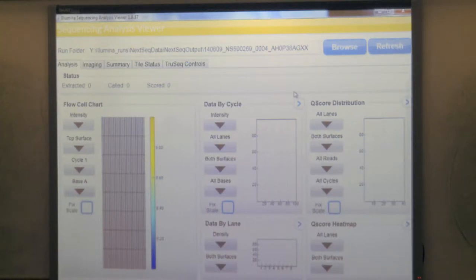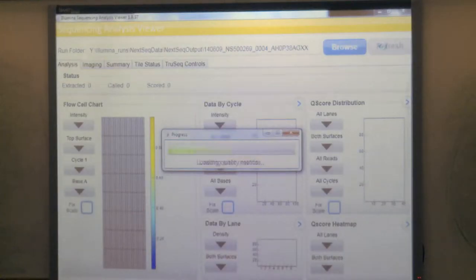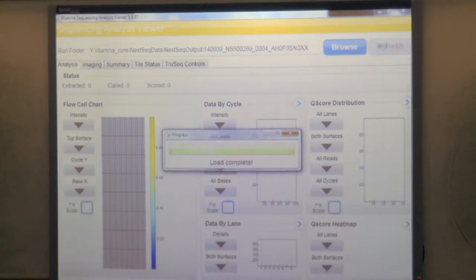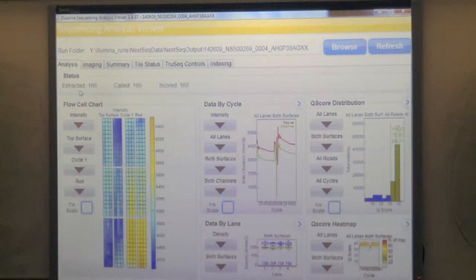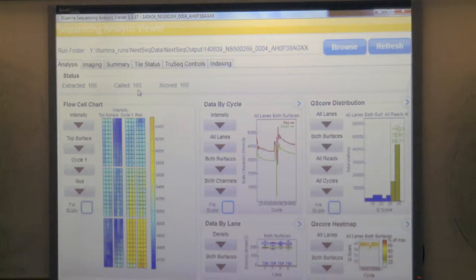The raw data file extension before FASTQ files are generated is .bcl, which stands for base calls files. I hit refresh and all the statistics for the run load into the software. I find this very useful - you can see the status of the run. In this case, my run went for 168 cycles: it extracted 168 cycles, did base calling for 168 cycles, and did quality scoring for 168 cycles. Everything went as expected.